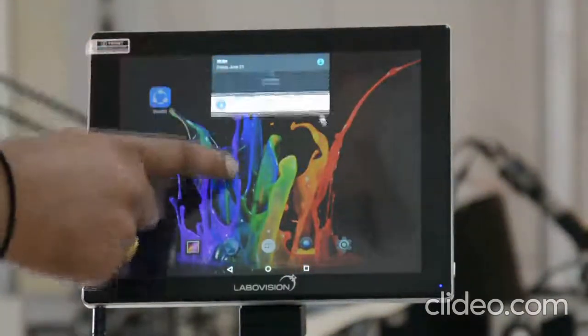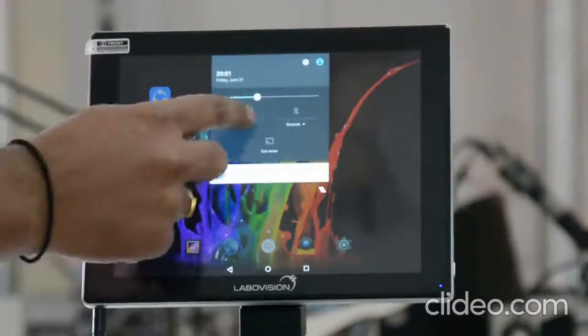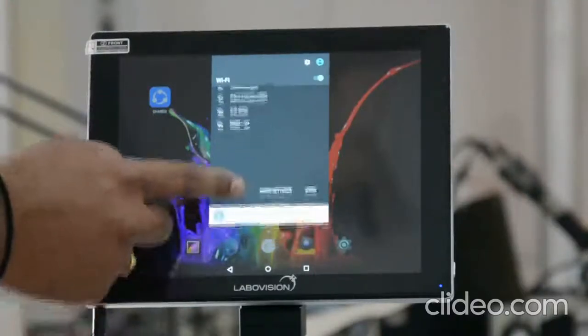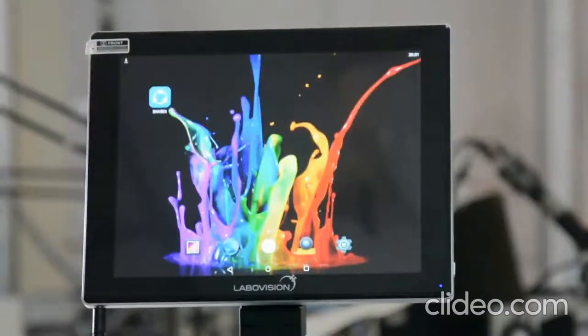You slide down. Now this is the Wi-Fi feature. You can connect to your home or work Wi-Fi station. And you can connect to any Play Store or any Android application. You can share the images. There are many features. You can open your email account. You can attach the image. You can send it to the institute or to your colleagues.